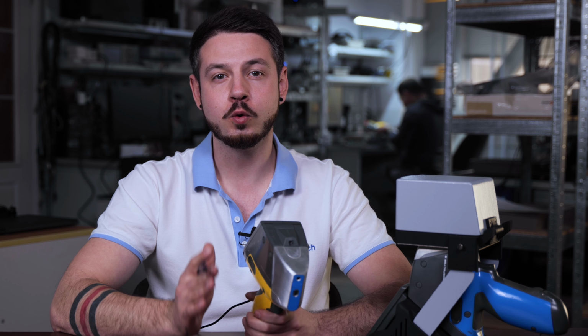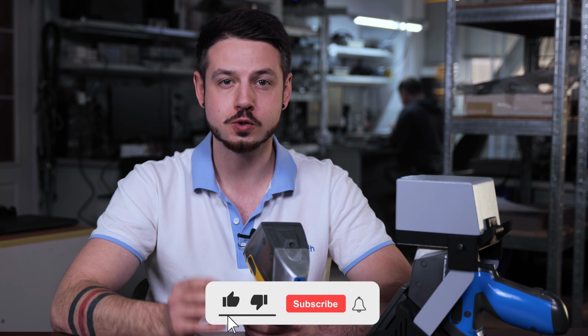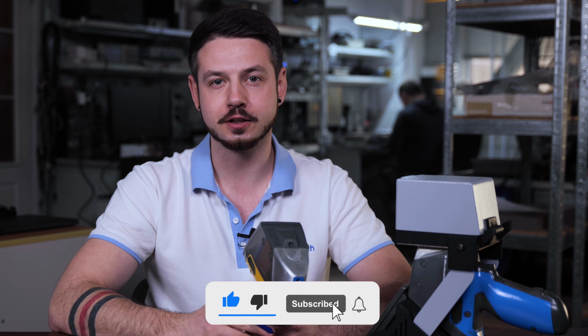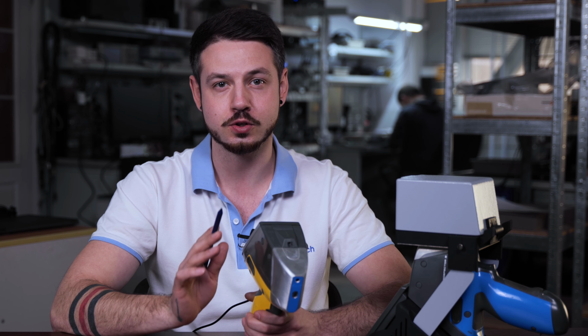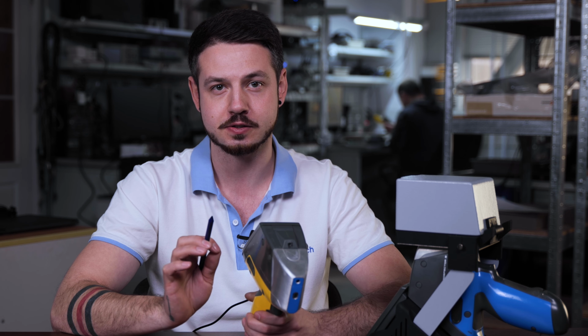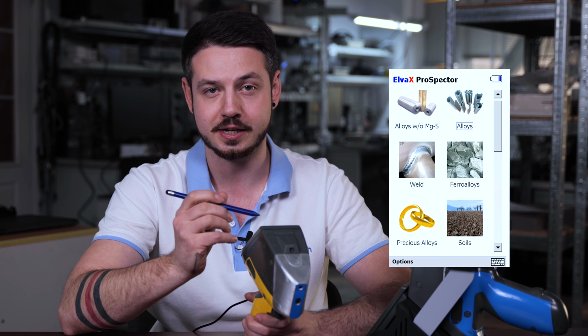Now your ProSpector 3 is ready to analyze, but before we get started, let's do some initial setup to ensure maximum accuracy and efficiency of analysis. Now we move on to the calibration selection. Depending on your application, choose the right one for analyzing alloys with or without light elements. This is the key point to ensure the accuracy of your measurements. In our particular case, I will choose the calibration with light elements. Here we go.